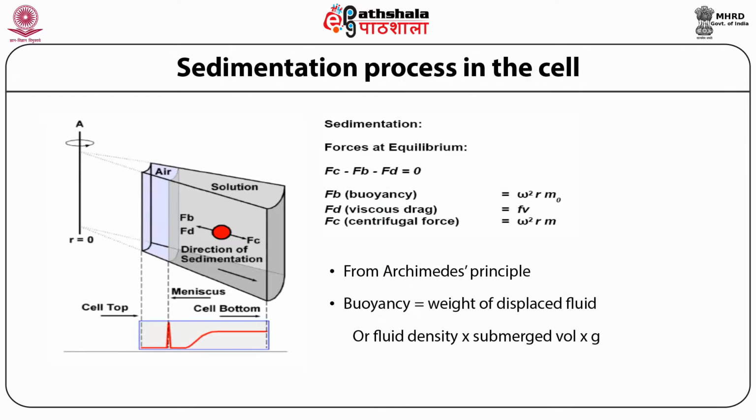You can see the sedimentation process in the cells is going on, and that simply follows Archimedes' principle: the buoyancy equals the weight of displaced fluid, or fluid density times the submerged volume times g. So at equilibrium, the buoyant force and viscous drag equal the centrifugal force. If you combine all the forces, the net force will be 0. This is the basic principle for the sedimentation of molecules inside the cell.